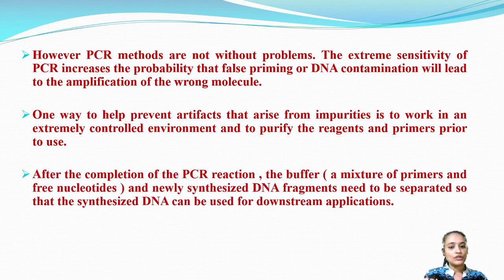After the completion of the PCR reaction, the buffer, which is a mixture of primers and free nucleotides, and the newly synthesized DNA fragments need to be separated so that the synthesized DNA molecule can be used for further downstream applications.